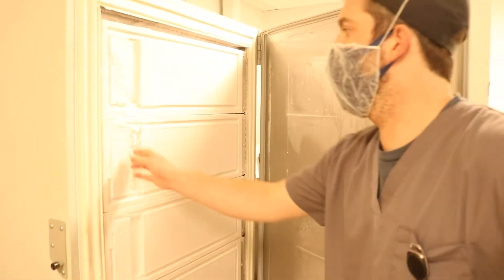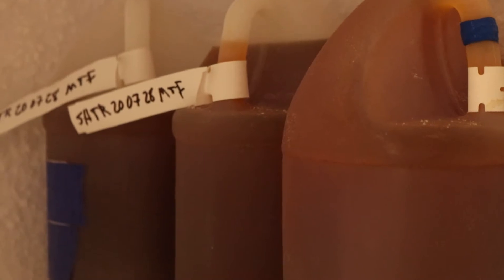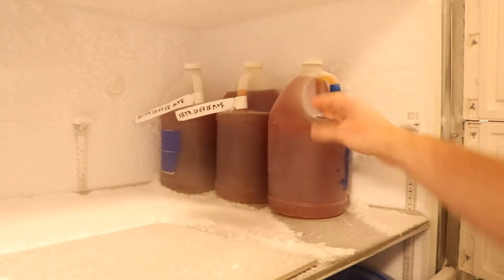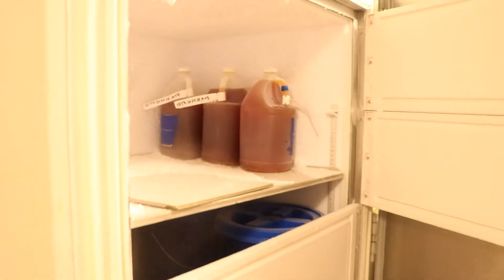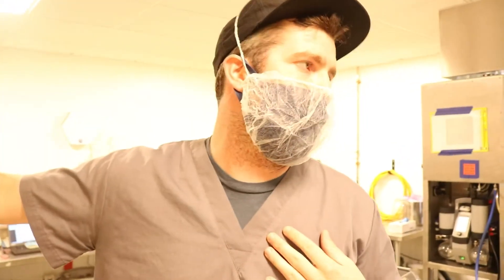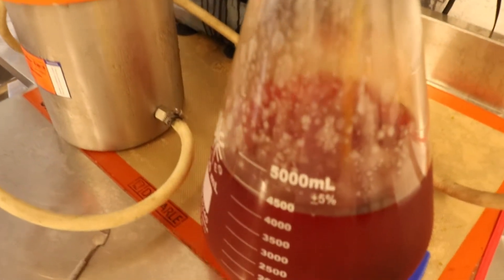This is our deep freezer. After the first distillation, we can put our cannabis oil and ethanol solution into here. We leave it typically for a period of time that allows the waxes and lipids to drop out. Once it's sat in here for that period of time, we'll run it through our Buchner filtration system again, and that allows us to remove the waxes and lipids from the cannabis oil, leaving a more pure substance.